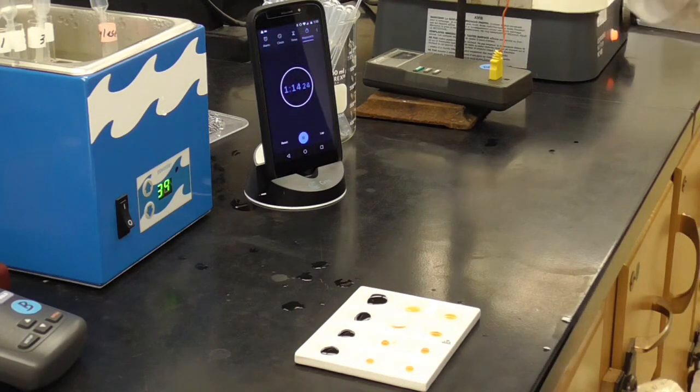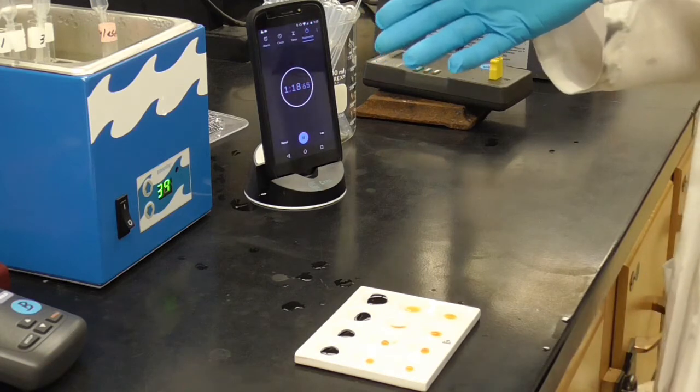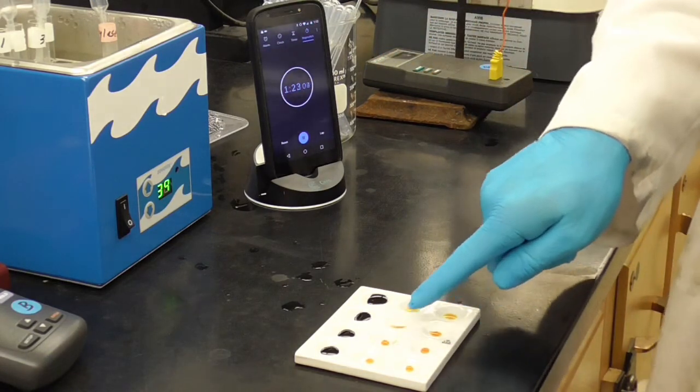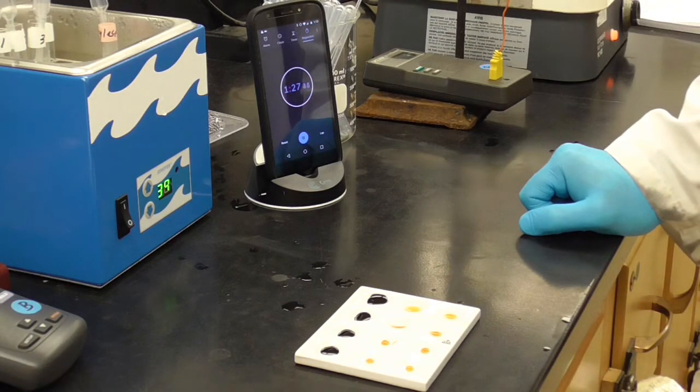Hopefully, it is catalyzing the breakdown of the starch. And so in 5 minutes, we test it again. There's not going to be as much starch in those test tubes, and we might start seeing a difference, therefore, in the color of these. We'll do the same thing at 10 minutes as well.